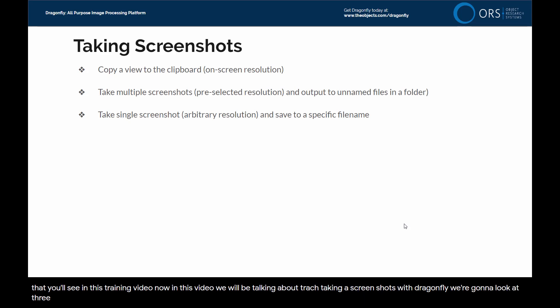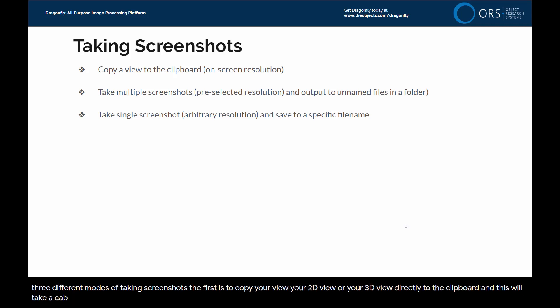We will be talking about taking screenshots with Dragonfly. We're going to look at three different modes of taking screenshots. The first is to copy your view, your 2D view or your 3D view, directly to the clipboard.